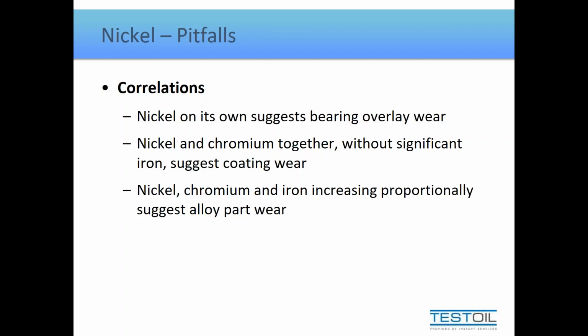It's a very important part of doing the proper interpretation of all the various wear metals, is not so much isolating each element and seeing if it's increasing, but seeing what it's increasing alongside, and if that increase is remaining proportional or if it's disproportional.